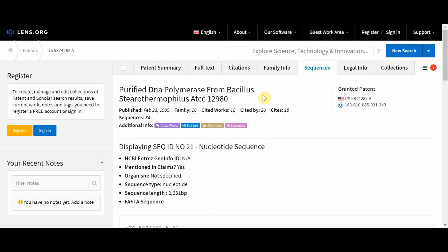Of course, sometimes that's not always wanted, particularly for things like polymerases, which can be insoluble when they're expressed. So they might need some time to fold correctly in order to maintain solubility, but we're going to control the speed of expression using environmental factors such as temperature. So we could incubate at lower temperatures if we find that's a problem, or we can use more reliable and reproducible methods such as promoter sequences and regulatory elements, rather than relying on the codon optimization to do that piece.